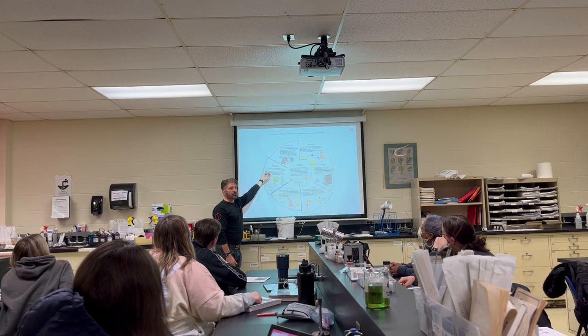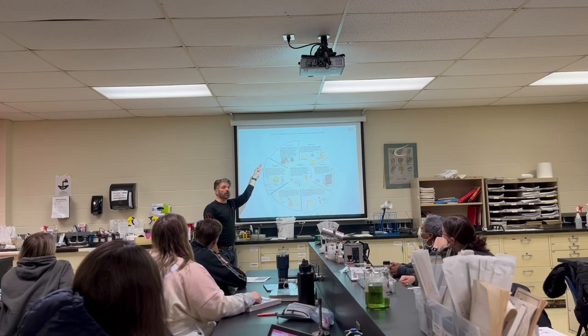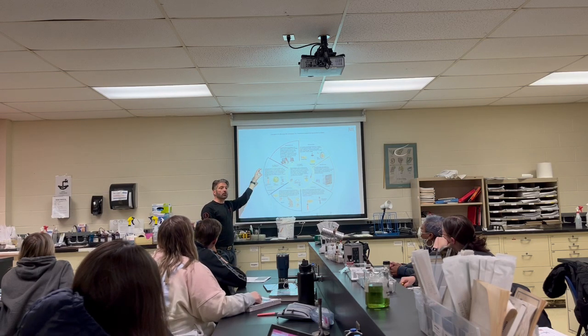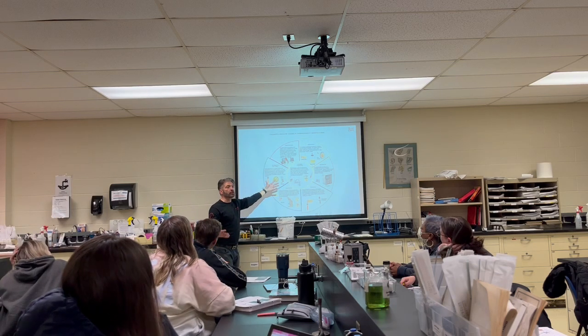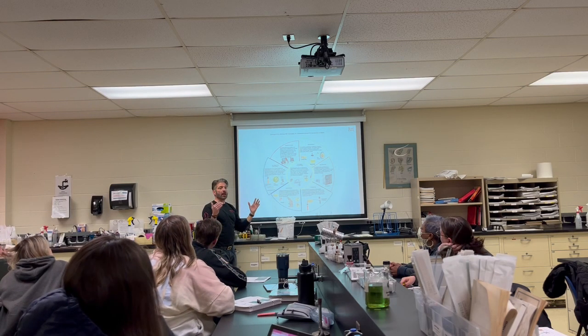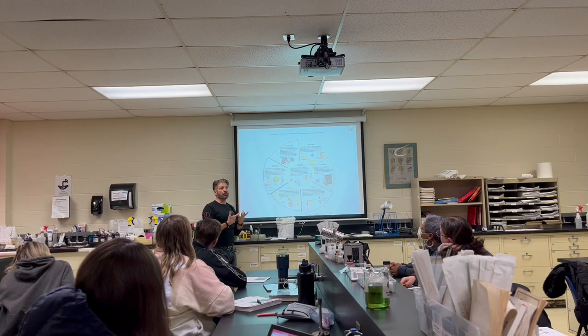So we're going to put the bacteria on a plate. We're going to take each disc, soak it in a certain disinfectant, or we'll use an antibiotic disc. We'll place it on that plate, and we'll come back a week later and say which one had the biggest zone of inhibition. So which antibiotic inhibited the bacteria the best? And that would be the one that you would prescribe, possibly.